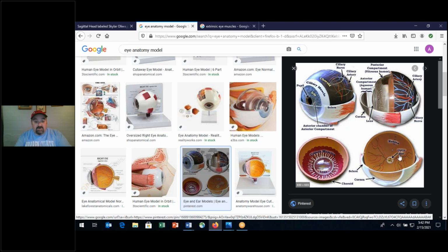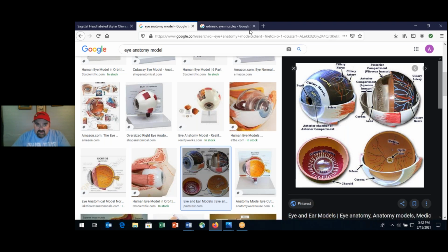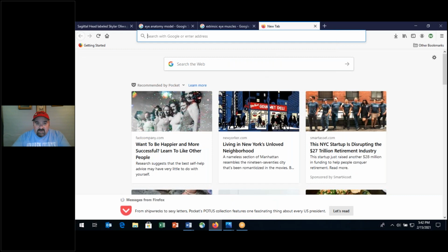You've probably heard the term detached retina, and this is not a good thing. This would be a medical emergency, and it can really lead to blindness if, as a result of some type of injury, the retina detaches from the choroid layer. And again, issues with the vitreous humor could also be a contributing factor to problems with the retina. I would like to show you the fovea.